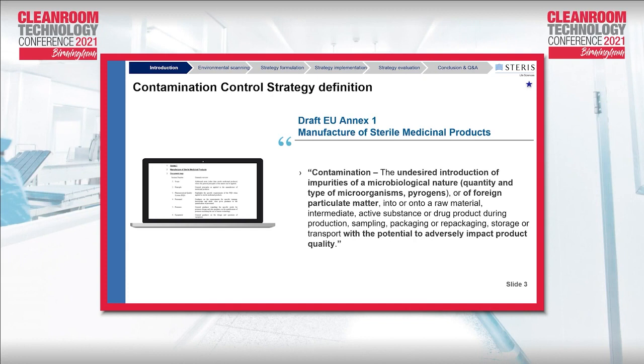And then we look also at foreign particulate matter, which is well described in the USP and the European Pharmacopoeia. That is entering into the material, intermediate, active substances, etc., everything that is related to the product that can have a potentially adverse impact on the product quality and therefore on patient safety.